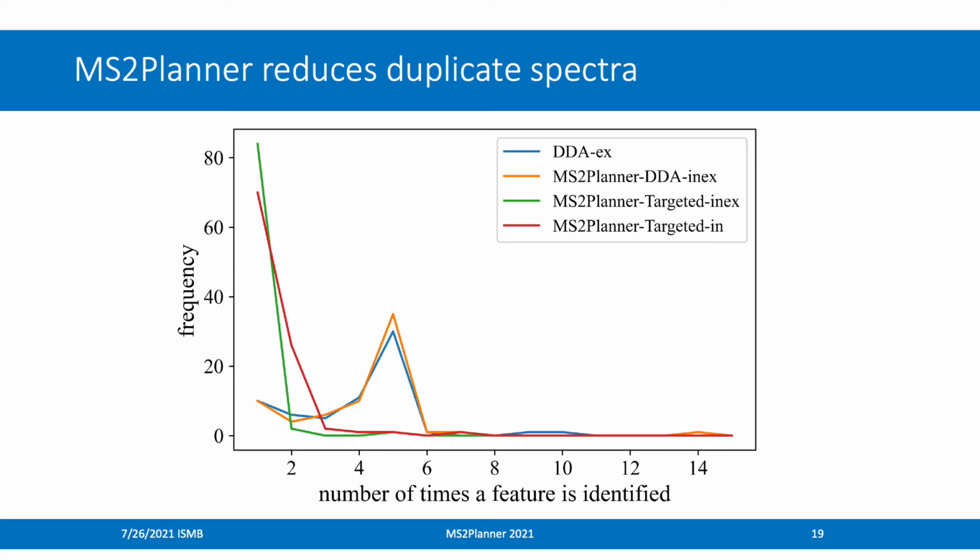So we compare these 4 strategies. For each of them, we run the experiment for 5 times on the same sample. The sample consists of NIH natural product reference molecules and some background fecal or tomato samples in order to increase the sample complexity.